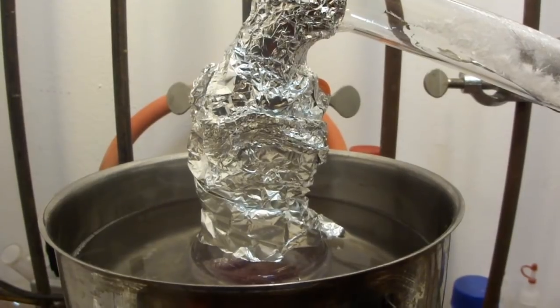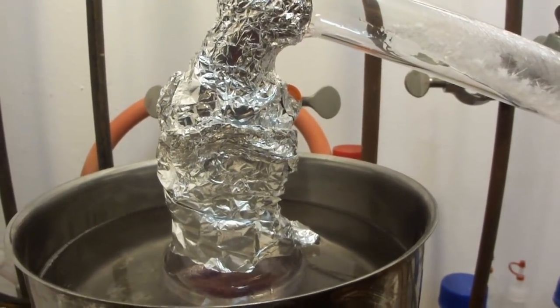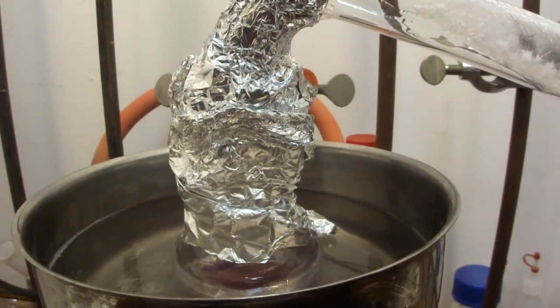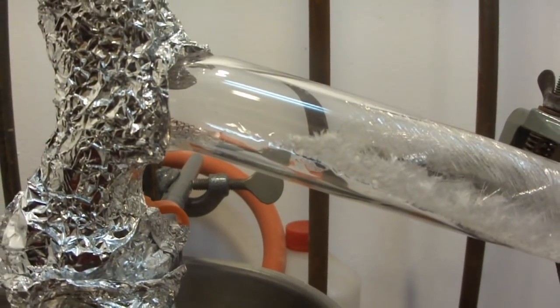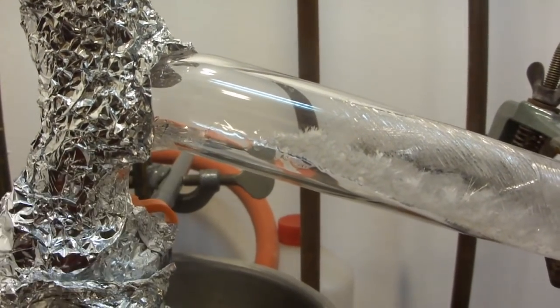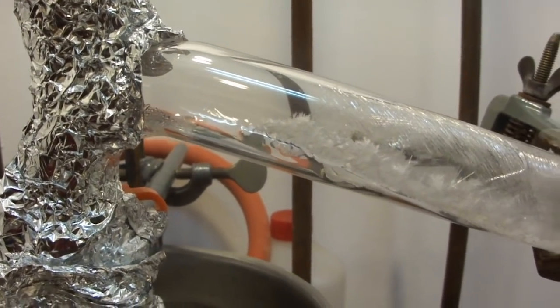So in the beginning it is advisable to just remove the aluminum foil every now and then and just to check if the path is free. Now once the distillation is going, you can of course see that new vapor is condensing there, so you know that the path is not blocked.